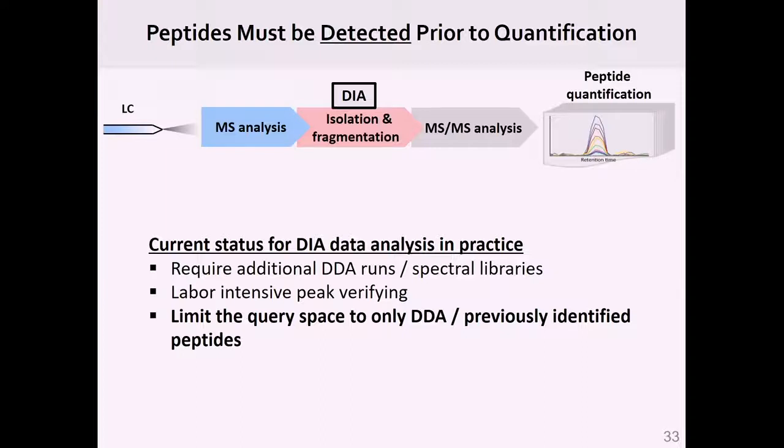The other thing I'll point out too is that the MS2 is way more sensitive than the MS1, but with data-dependent acquisition, we're triggering off the MS1. And so we're ultimately going to be limited by whether or not we can distinguish the MS1 signal from background, which is definitely a challenging point to start with. So often that will require doing things like fractionation or doing other tricks in order to improve this.